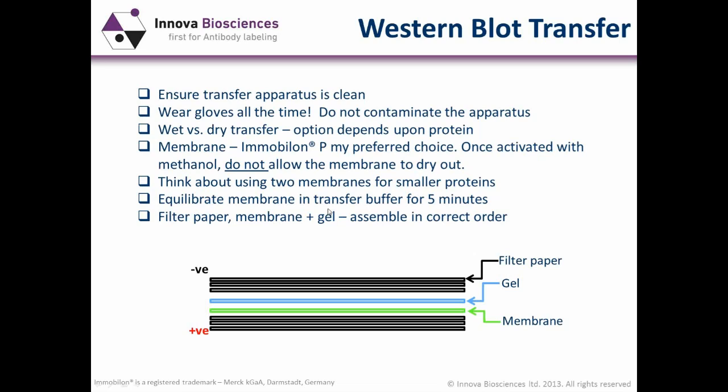It's very important because once it's activated, you should put it into the transfer solution, and you want to make sure you do not allow the membrane to dry out while you're doing other things, let's say, preparing the gel for the transfer process.